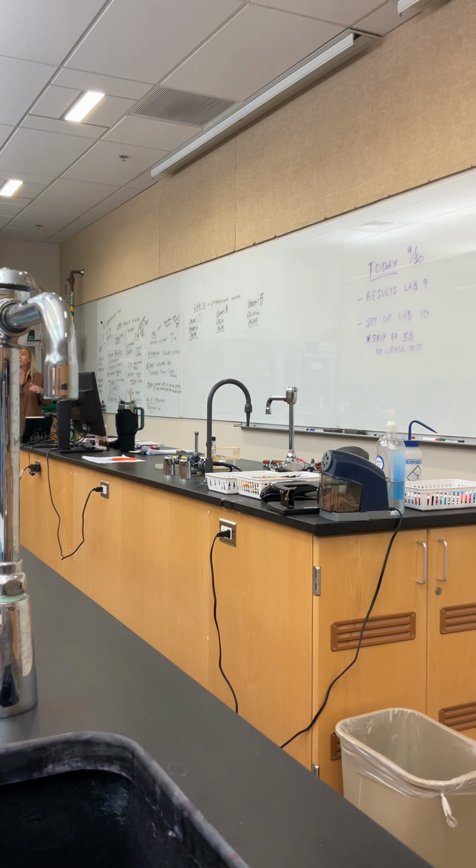If I did a gram stain wrong, and let's say I thought a gram-positive was really a gram-negative, maybe I over-decolorized, and I put them on an EMB and a MacConkey, thinking that it's a gram-negative, and I come in the next day and it doesn't grow. What does that tell me about my gram stain? That I was wrong. And that tells me I need to go back and do it again. Do you see how that works? So these media confirm our results.